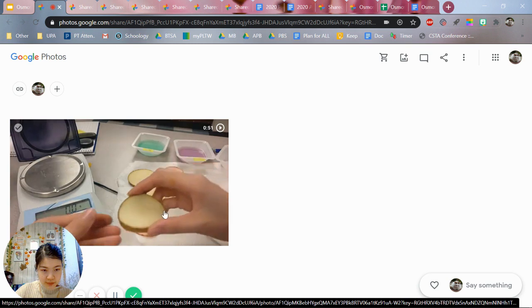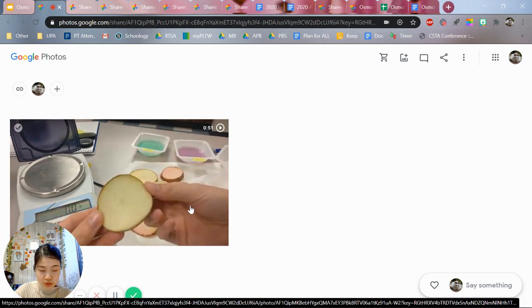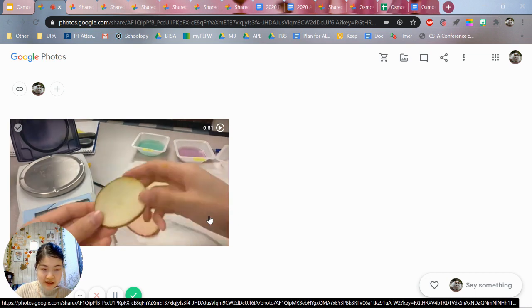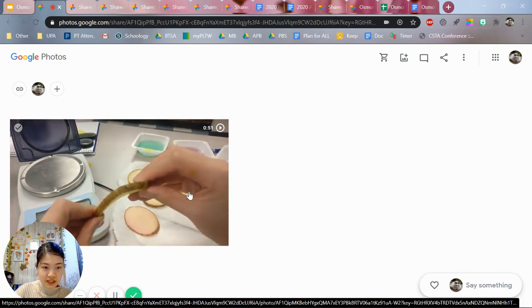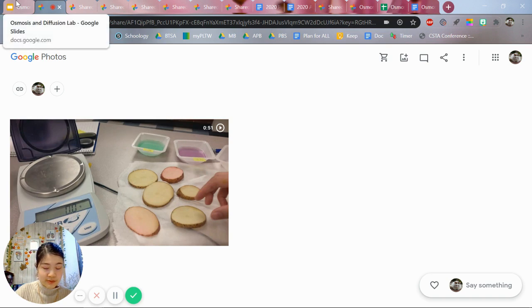You can tell like the pink and purple ones probably, but the others, maybe ones like light green. So it's up to you if you want students to use the russet potato because of the way I sort of messed up in making my video clips. I still gave this to my students and they were able to glean whatever qualitative data they could. I told them it wasn't going to be a big deal because they would have the calculations from the before and after masses, and that was all that mattered.